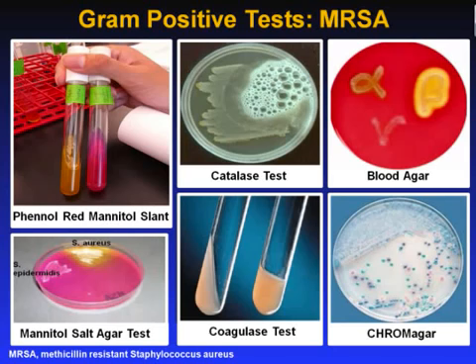If not, the organism is catalase negative. Streptococci and enterococci are catalase negative. While the catalase test alone cannot identify a particular organism, combined with other tests such as antibiotic resistance, it can aid in diagnosis. The presence of catalase in bacterial cells depends on both the growth condition and the medium used to grow the cells.